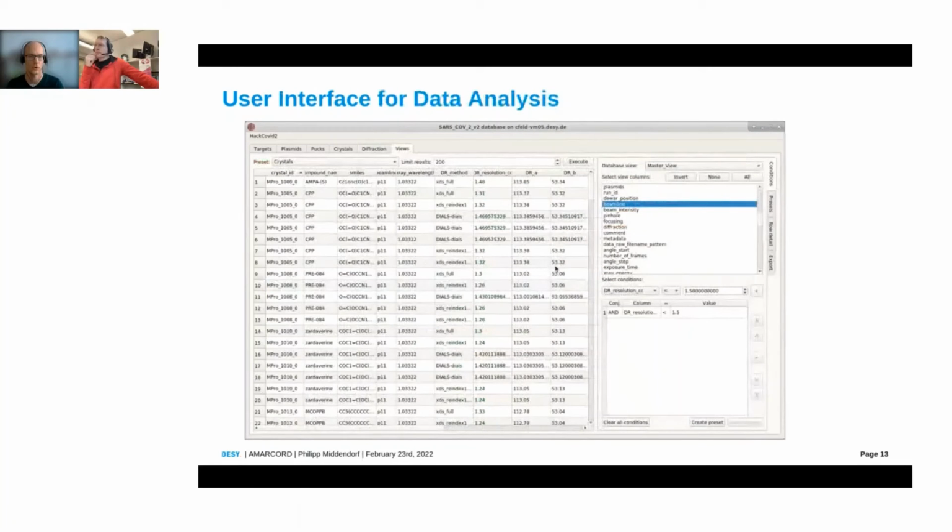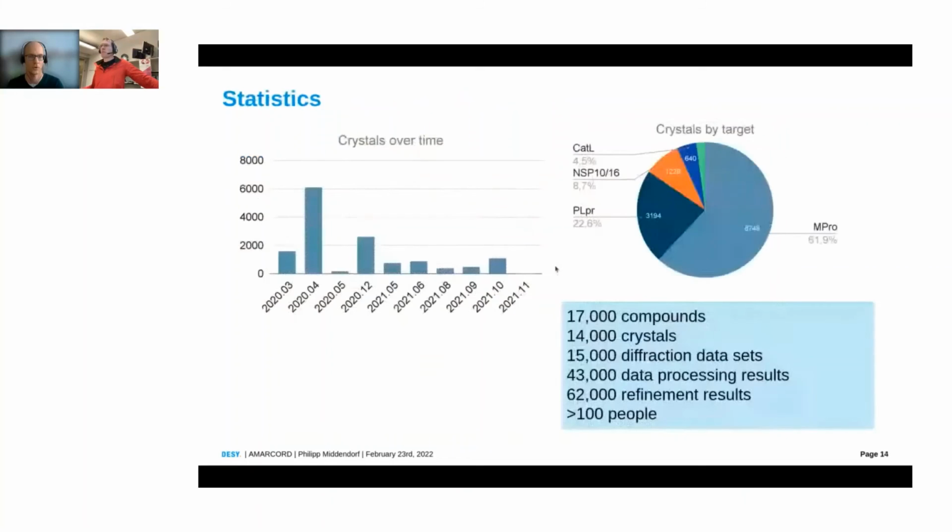And the analysis people, by now you know this, also have a table, but this one is sort of a super table, because you can choose which columns you want to display, and you can also have filters and all of that. Yeah, that's basically it.